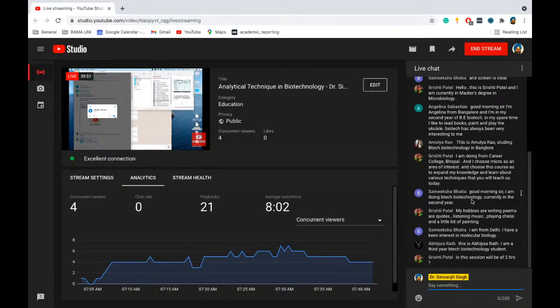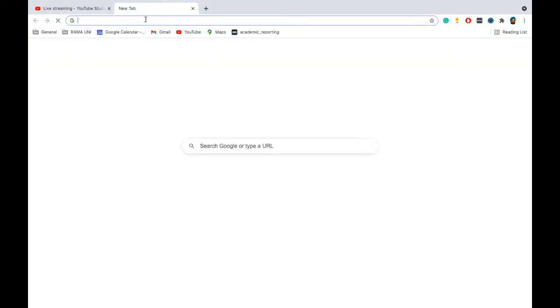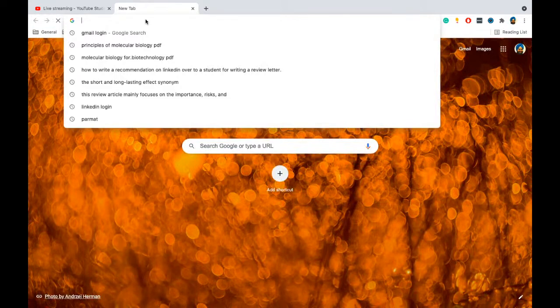So now I will take you to the virtual level of DNA isolation, how we do the DNA isolation.